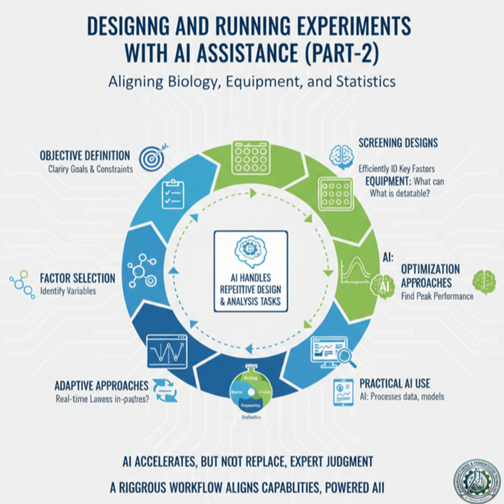And the sources point to specific designs for this, like Plackett-Burman or definitive screening designs, usually just called DSD. Plackett-Burman. It sounds like a law firm. It really does. If you've been injured by a bioreactor, call Plackett-Burman. I like that. But biologically, it's a very clever, very sparse design. It lets you look at a lot of factors with very few runs. Okay, so what's the trade-off? The trade-off is resolution. You won't get a detailed map of exactly how everything interacts, but you will get a big red flag waving over the 3 or 4 factors that actually matter. So it's a coarse filter. You toss everything in, shake it, and see what big rocks are left. That's a great way to put it.